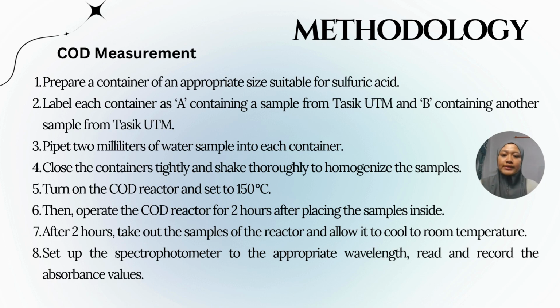Then operate the COD reactor for 2 hours after placing the samples inside. After 2 hours, take the samples out of the reactor and allow them to cool to room temperature. And then set up the spectrophotometer to the appropriate wavelength, read and record the absorbance values.